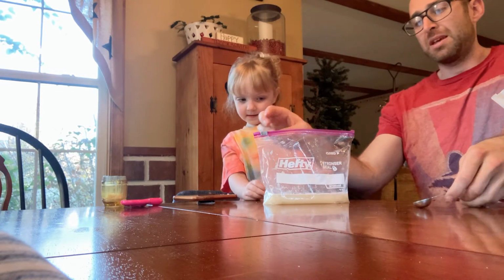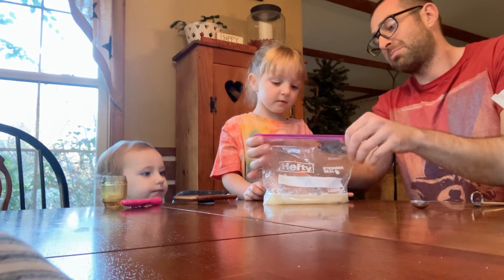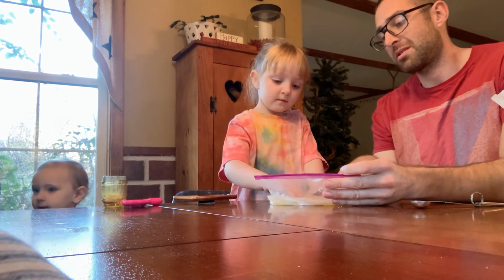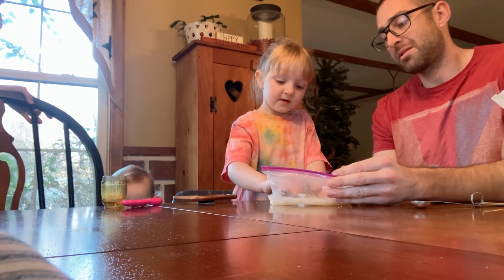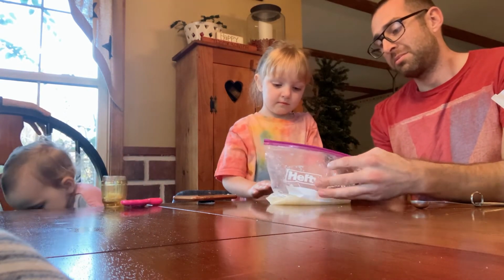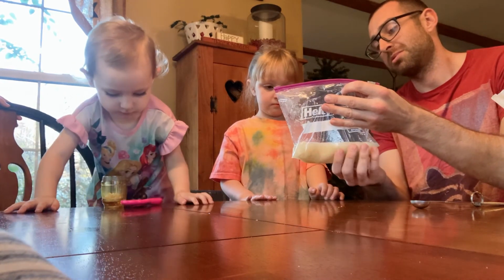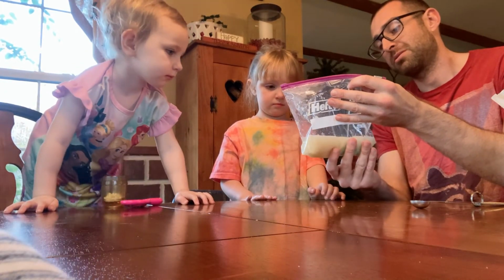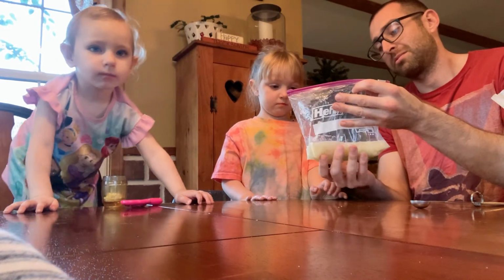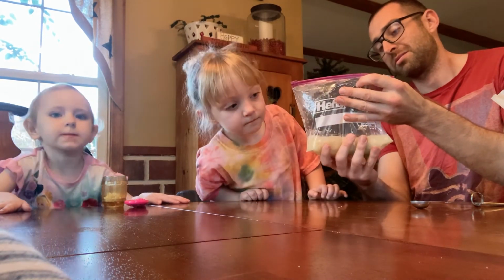So we put that in, and now we want to mix it, but we want to mix it really gently because we don't want to make a lot of bubbles. So we're just going to slowly mix. You want to help? You can just push down like that. Yeah, good job. Nice and warm. We'll mix it a little bit, but we'll try not to make so many bubbles. We want to make sure it's in there. So hopefully this is breaking up those cells that I talked about.